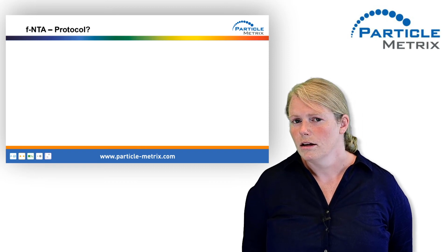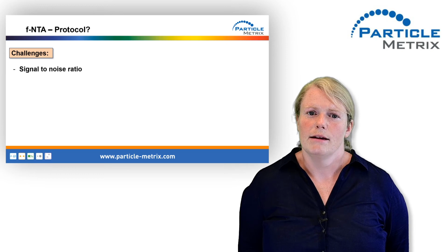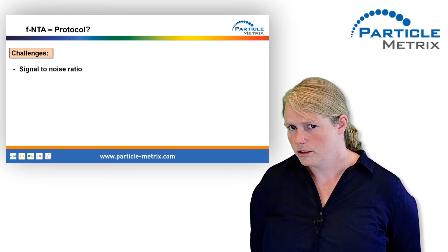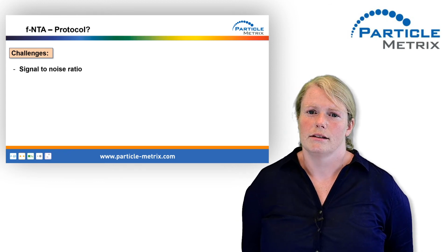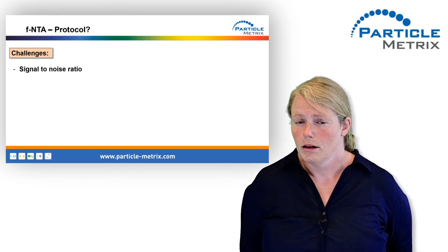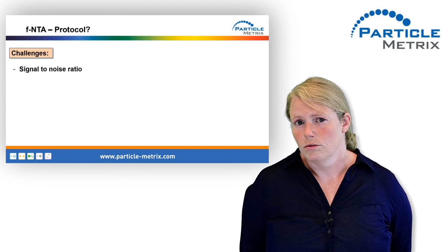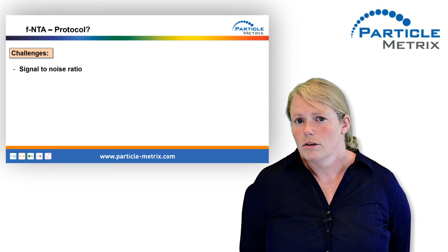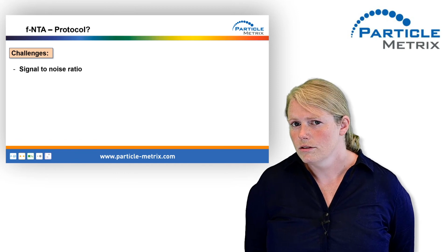Challenge number 1, we are working with fluorescence and with stain with a high amount of dye. So it would be good to wash all the unbound dye away. But unfortunately, we are working with very small particles. Washing is a problem. It would cost us a lot of time, and we would for sure lose a portion of our signals of interest. Since we cannot wash, we are dealing with a lot of unbound dye, so the signal-to-noise ratio is a challenge here.